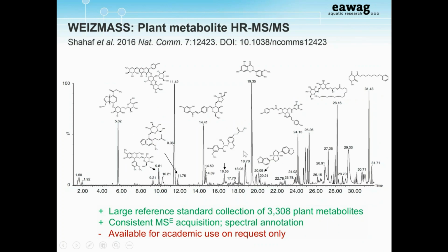They measured these all in mixes, which is what you can see here in the chromatogram. And they've done a consistent MSE acquisition and spectral annotation on their library. So if you're into plant metabolites, this is a really nice collection for you. This is only available for academic use on request, and I have not yet managed to put my request in. So I can't say terribly much more.